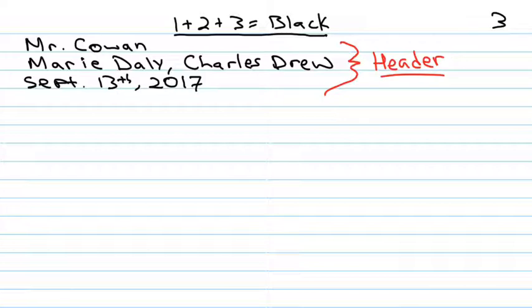Now, when you're writing in your lab notebook, it's crucial to note that you must write in blue or black pen only. No pencil, no red, nothing like that. So what you're seeing in red right now, this is just my notes, so that way you know what section we're talking about in the notebook or on your rubric.